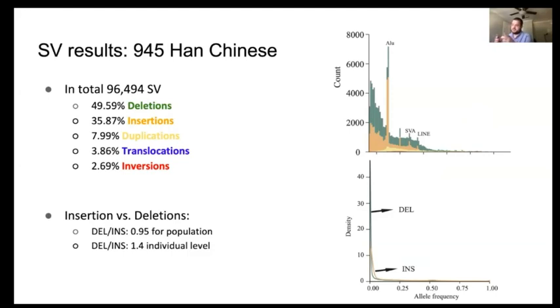And I see I have that labeling wrong here, sorry for that. So this follows the expectations that we know, for example, from the 1000 Genomes Project, where they assembled individual numbers but never looked at the harmonized population set. Here it makes sense that insertions are evolutionarily longer persisting in the population and might accumulate additional mutations that we would have currently merged together, disregarding certain SNVs in the insertions, and that is a research topic that is still going on.